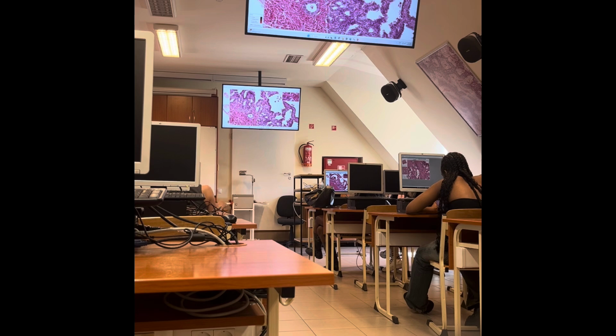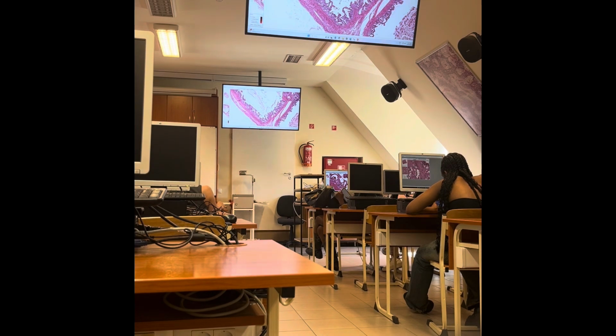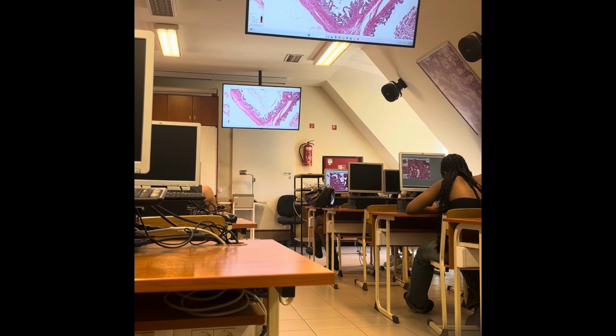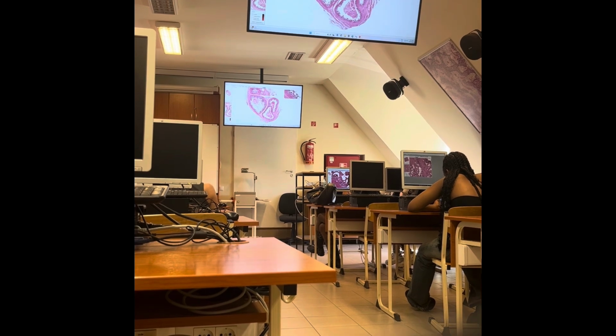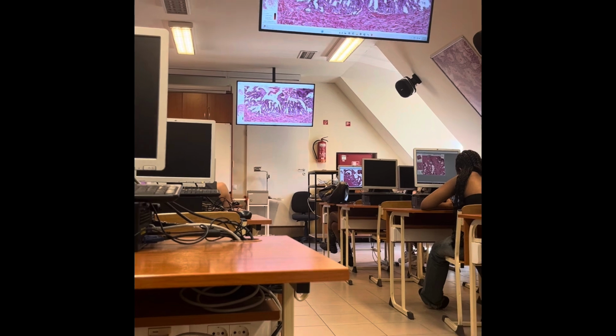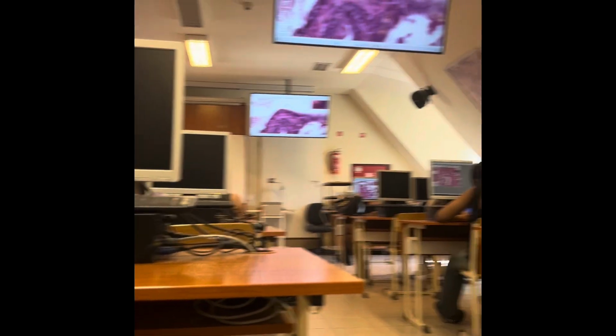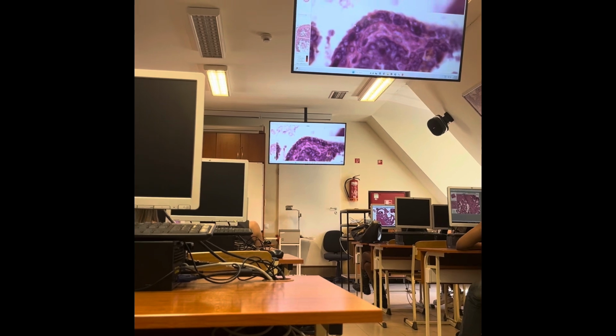Okay, anything else? Maybe connected with this specimen? Yes? In the handout, the description of the surface says that it should specify the stereocilia. Is that the case? In the previous specimen, the stereocilia were obviously visible. Here their number is decreasing. Maybe a few of them you can recognize.